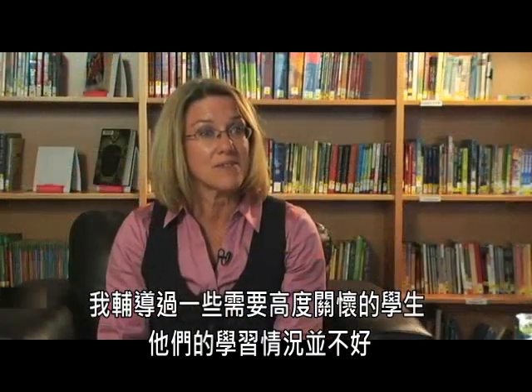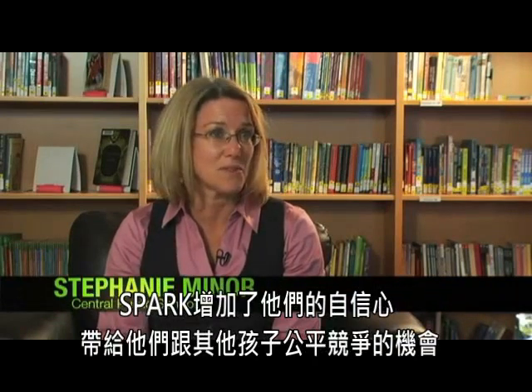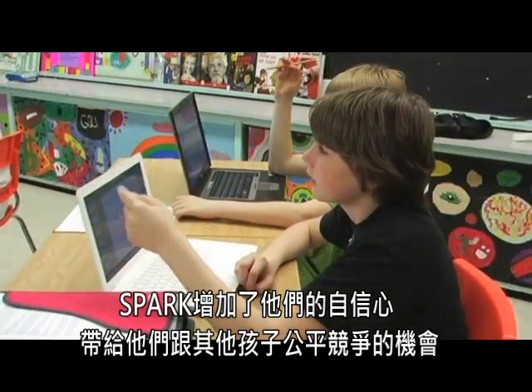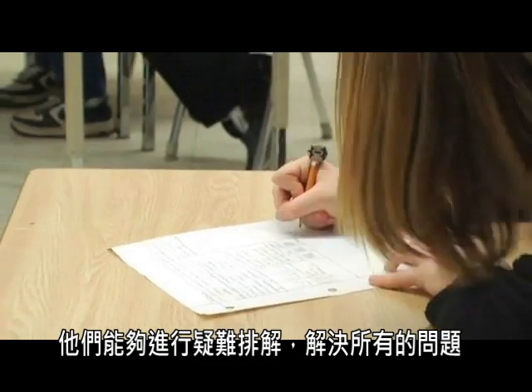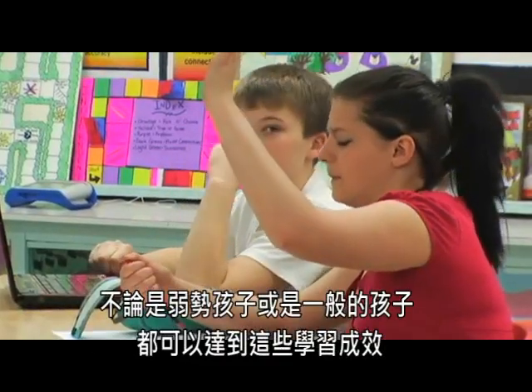I have several intensive support students, and there's no way you could tell those students. It completely levels the playing field, gives kids confidence in their abilities. They know how to use the probes, they're easy to use. They design their own experiments and they follow through. They're able to troubleshoot and problem solve all the way, and that's regardless of the student's ability.